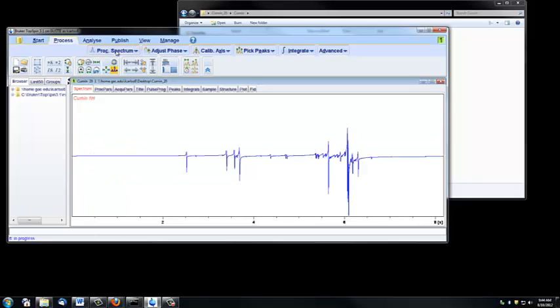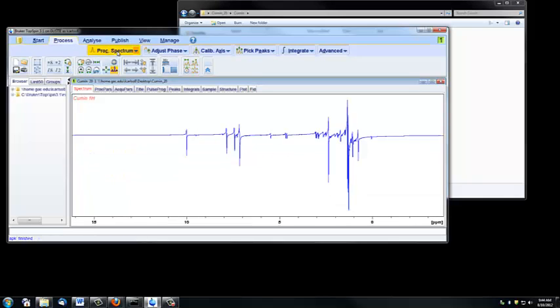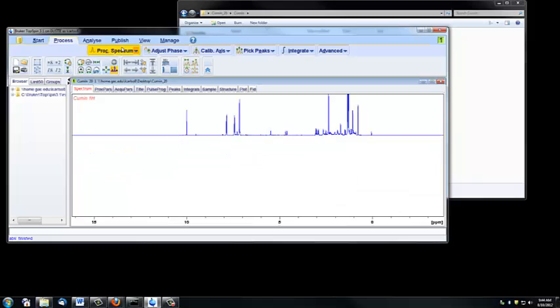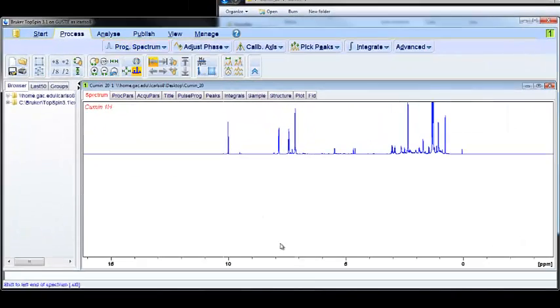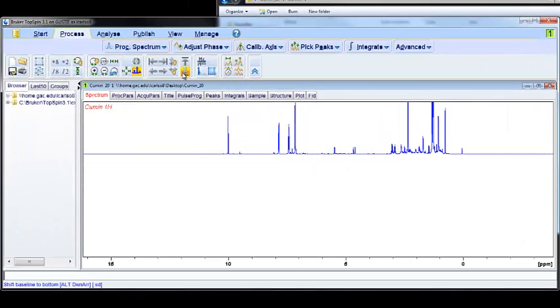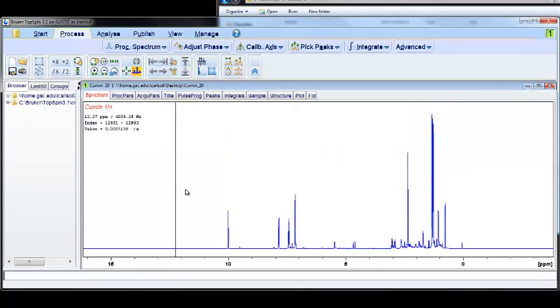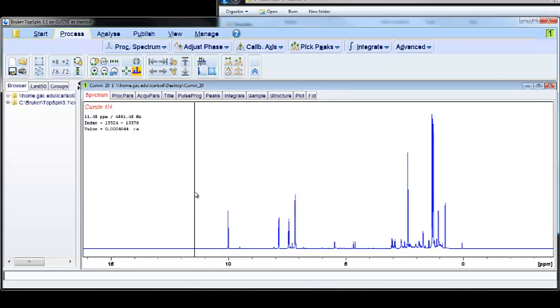This will actually perform three separate commands at once. You'll see that now this looks more like what you're probably used to an NMR spectrum looking like. I'm going to quickly walk through the three steps that the Process Spectrum button performs.